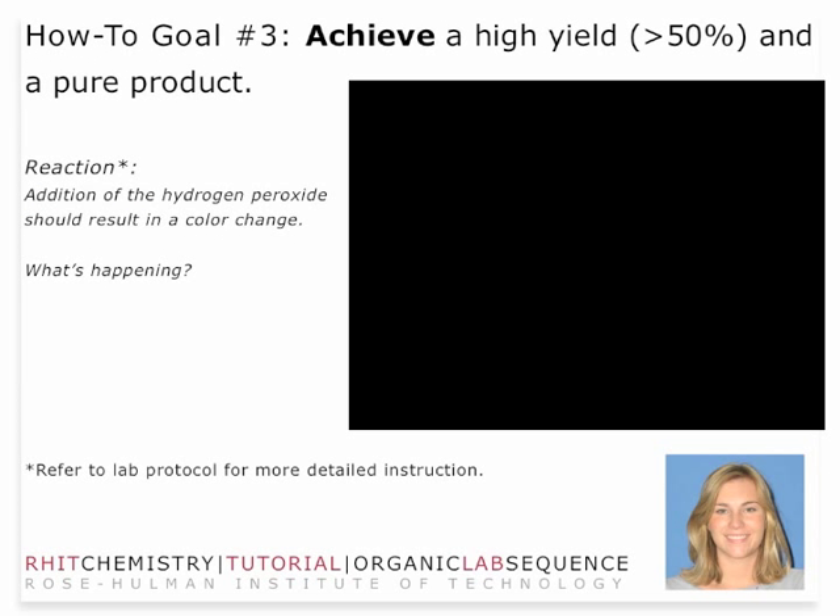Here is a video of the addition of hydrogen peroxide. You can see the dark color happen very quickly. That's a student in the hood actually adding the peroxide down through the condenser column into the solution. You want to do that very carefully. You'll notice that student did a very good job making sure all of the solution went through the condenser and didn't drop down to the side — that's a very important part of your technique that you want to perfect.